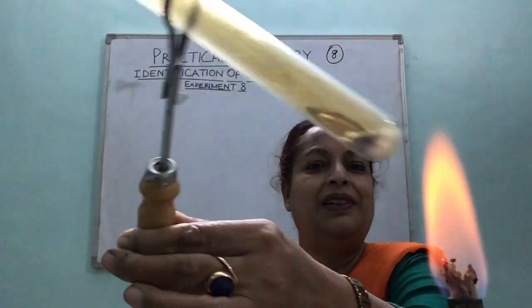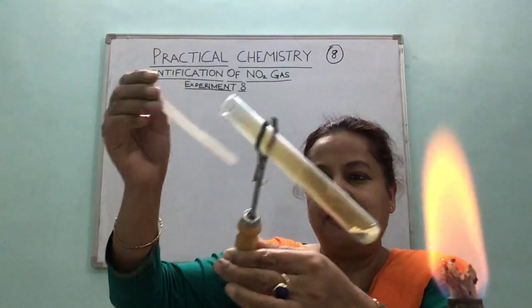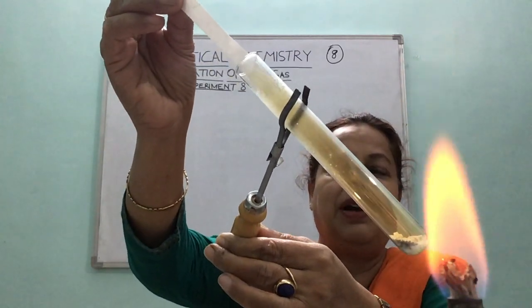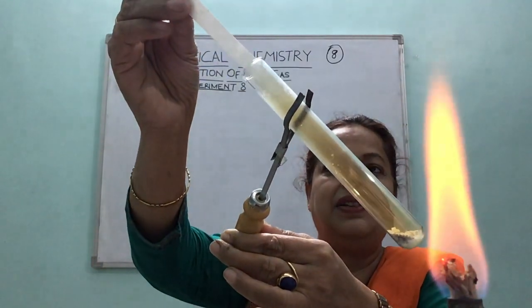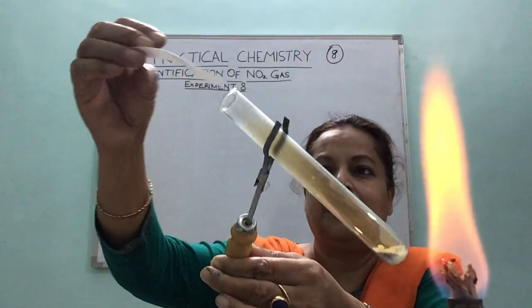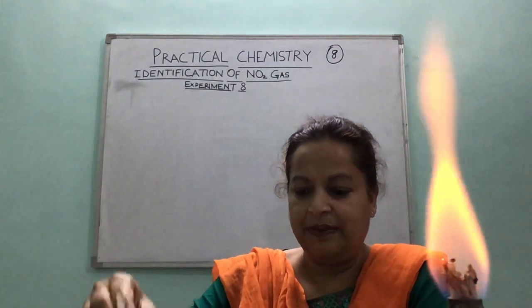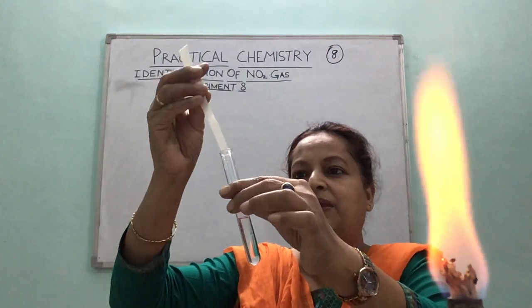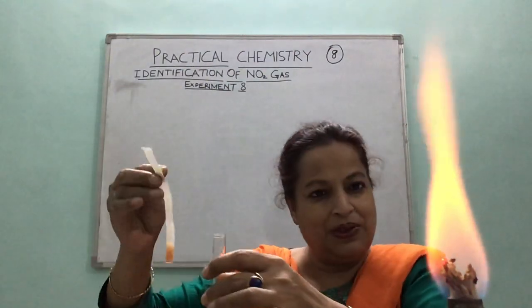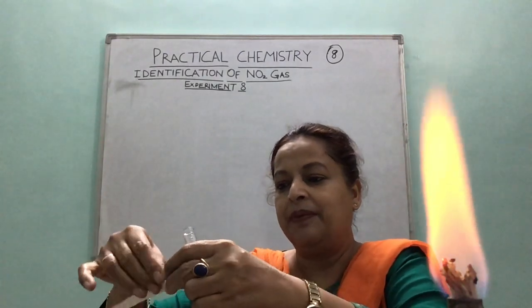See, okay, I'll stop heating it. We'll do the potassium iodide test. So I've dipped it in potassium iodide and bring it here near it. Now potassium iodide solution turns brown. Now this NO2, I did not arrange it. Let me dip it in this. This is potassium iodide. It was already with NO2. Okay, I'll dip it from the other side and then show it to you again.